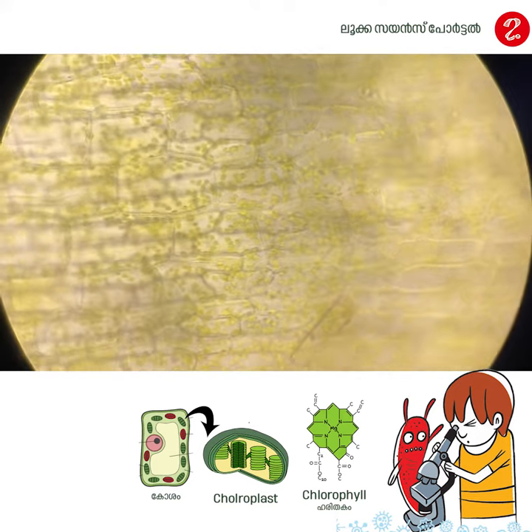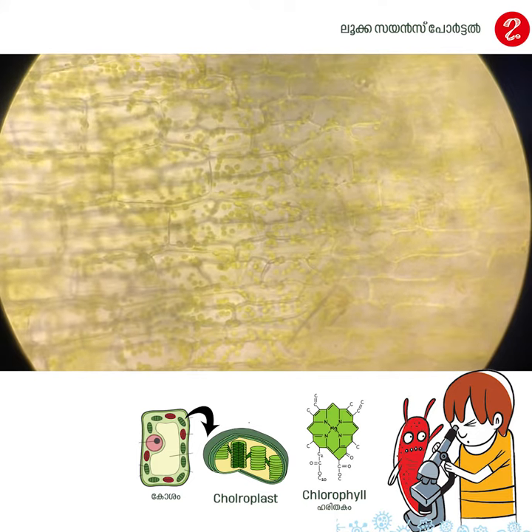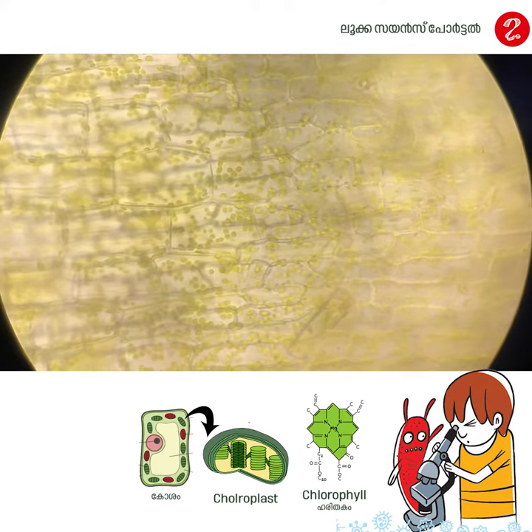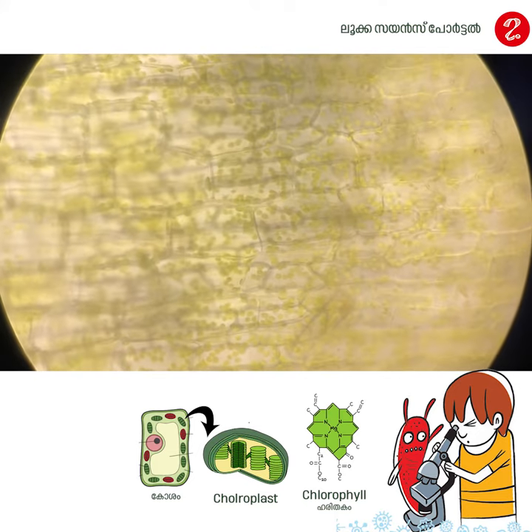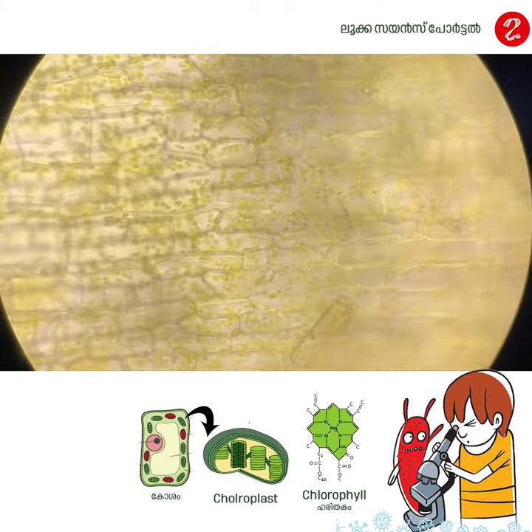This is a chloroplast. This is chloroplast.